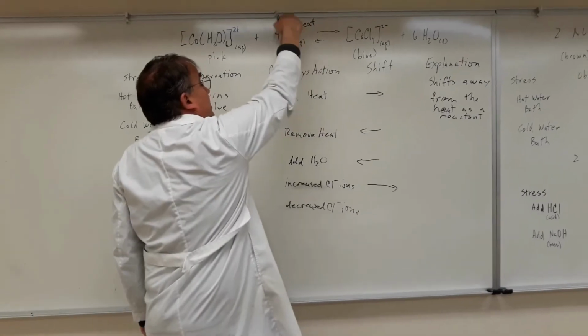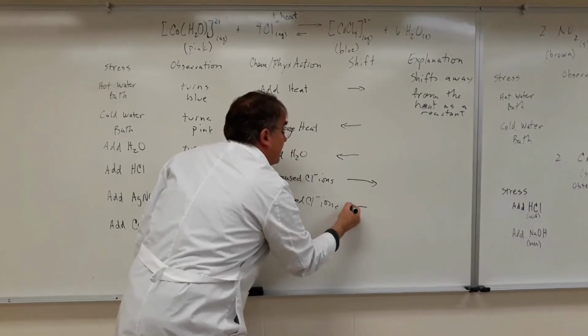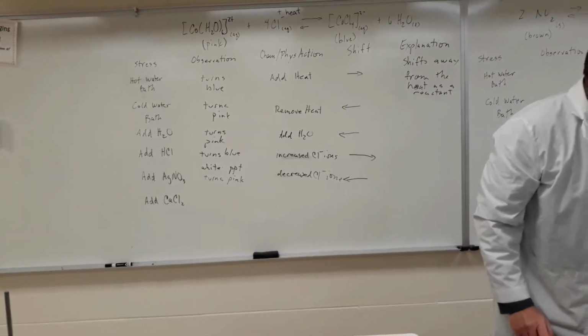So if you decrease, the shift is towards a decrease. Went from blue to pink. So the shift is this way. And then the last stress, pause.